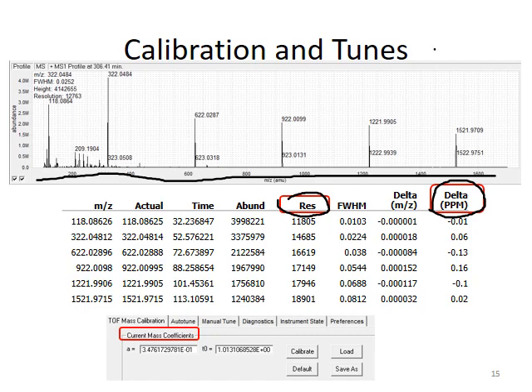When you are performing mass calibration, you come to this tab. You just need to click the button Calibrate. You will realize once you have done the calibration here, a new set of coefficients will be updated in order to correct some minor mass drift.